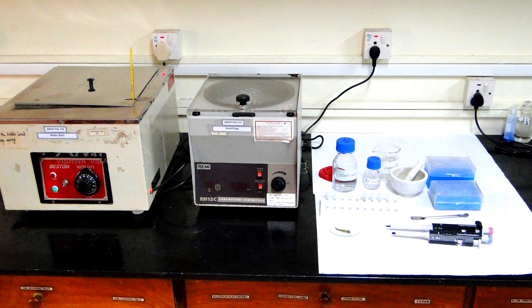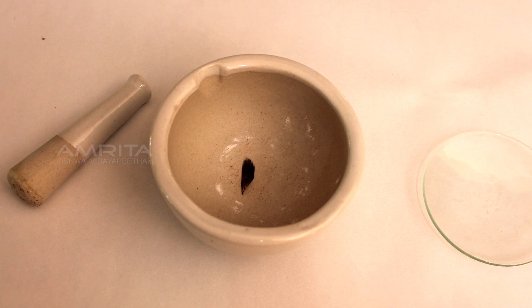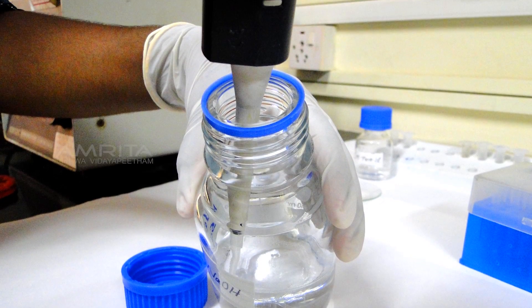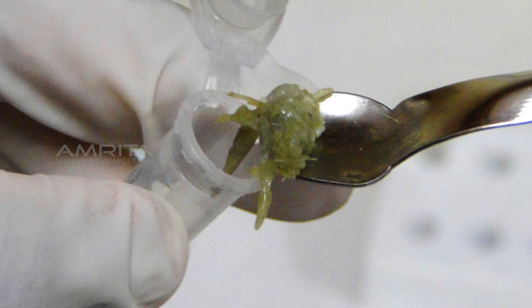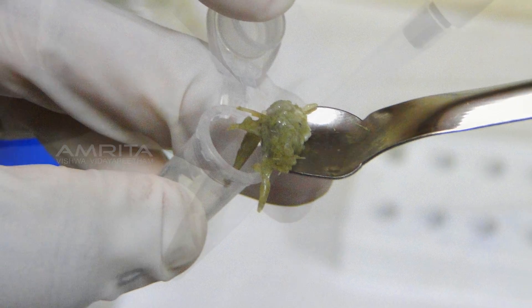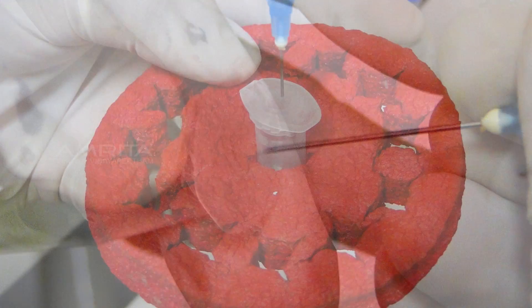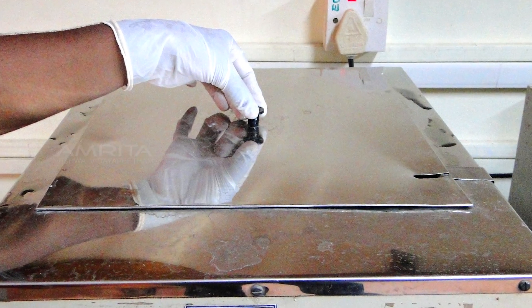Procedure. Ensure all required materials are at hand. Place a fish fin in the mortar and grind the fin using the pestle. Take 100 µl NaOH solution in a pipette and pour it into a vial. Transfer the ground contents into the vial using a spatula and mix the contents well. Take a syringe and inject it into the vial.